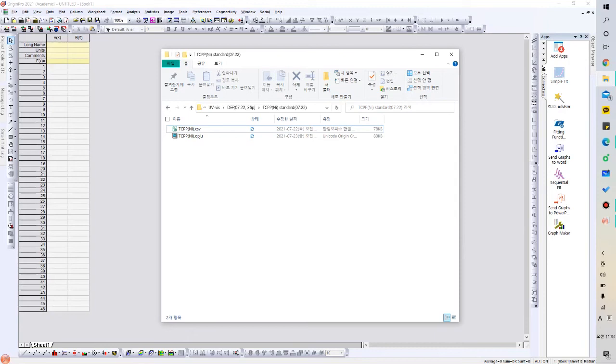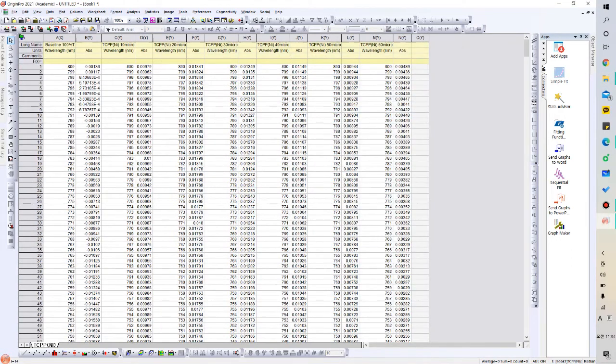Now, we'll draw the graph of the UV-Vis spectrum data. We exported the CSV data from the lab from the computer that's in the lab. We can just click Draw into this, and all of the data will appear automatically.